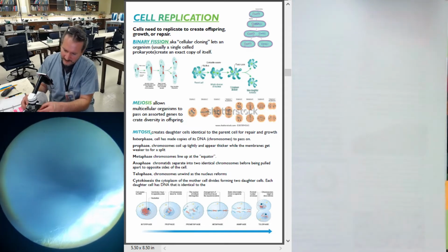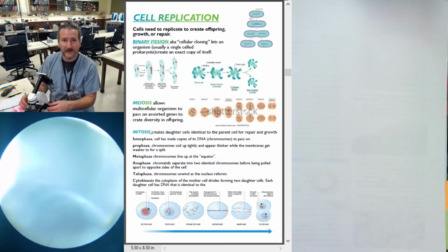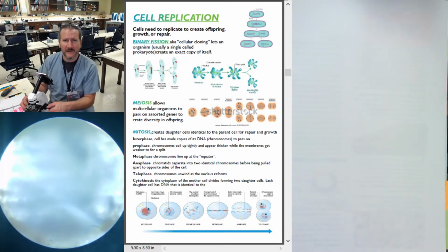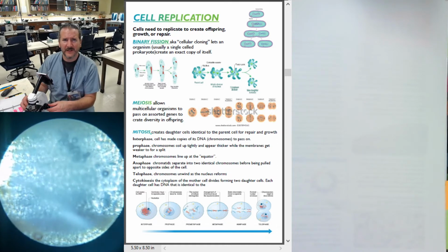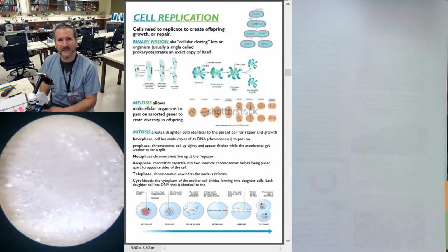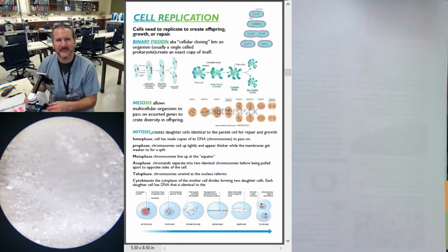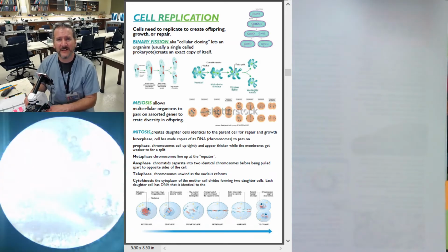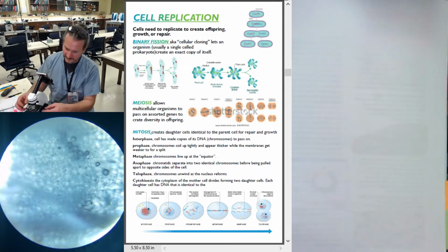Nope. That's a little more oniony. Sweet, look at all those cells. That's underlighting. There's overlighting. Still pretty cool. Nice.